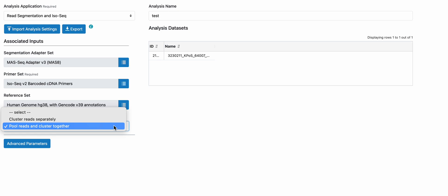The isoform ID, such as pb.x.y, those pb.IDs will not be the same across different samples if you chose cluster reads separately.